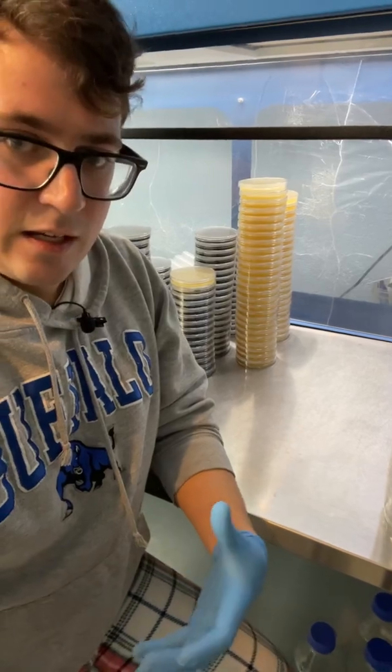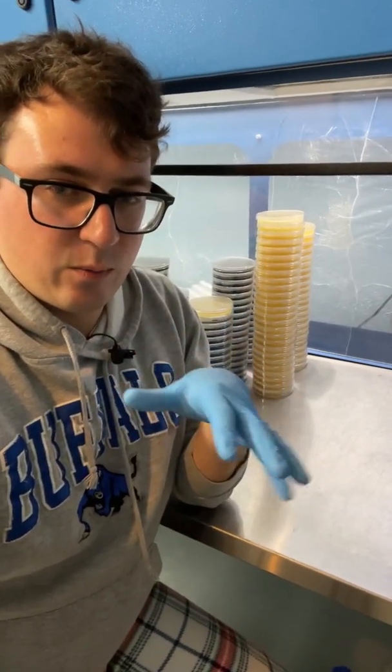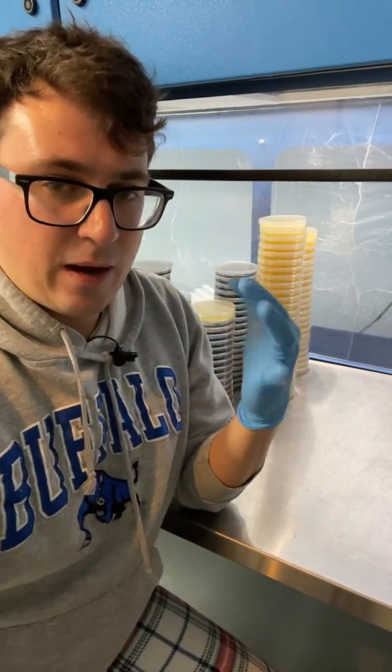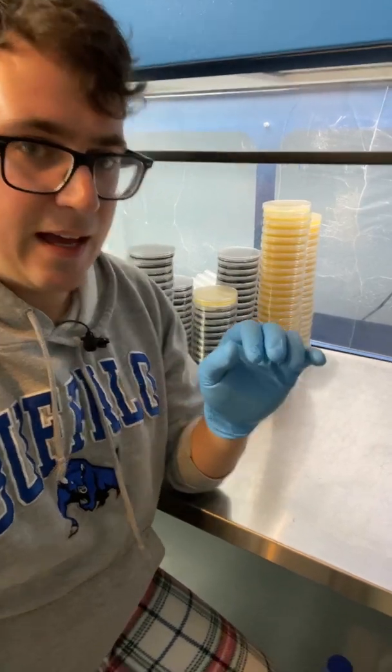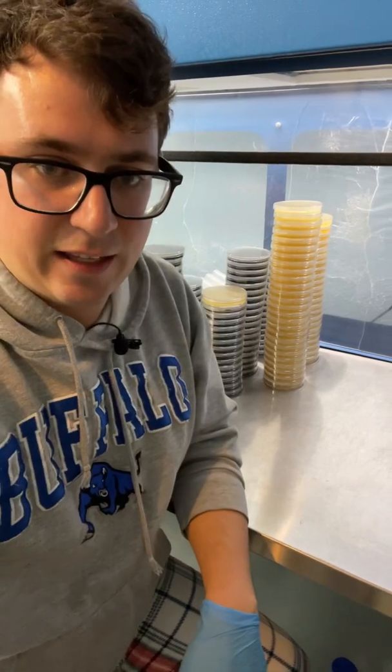Another trick is you want to pour at the right temperature. My agar was about 130 degrees down to about 121 degrees — that's the sweet spot. And you can avoid a lot of condensation like that.